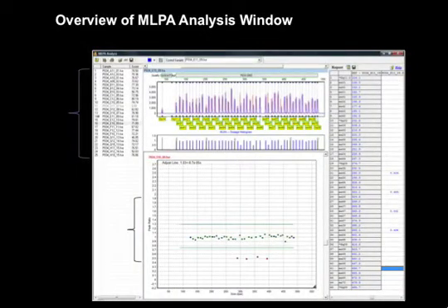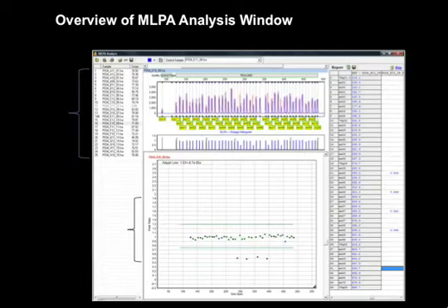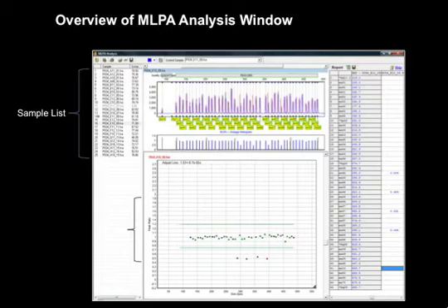Let's take a look at an overview of the MLPA analysis window. Across the top of the MLPA analysis window are icons for selecting the number of ratio plots to display, analysis parameters, the printer, and the control selection and save options. Samples are listed by file name in the left column of the page.